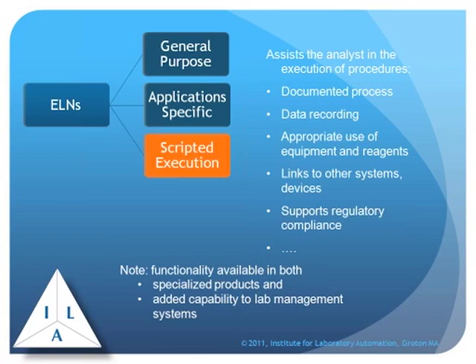The functionality for this type of application is available in both standalone products as well as capabilities that have been added to a laboratory information management system. The specialized products are standalone. They do their work, but they can also communicate to another system. You just have to make sure the integration works, and in some cases, do the programming. But the nice thing about them is that the templates are there for you to do all the procedures. Many of them come with procedures already built in, but if you've got to add your own, there's usually a fairly simple way of getting that done.